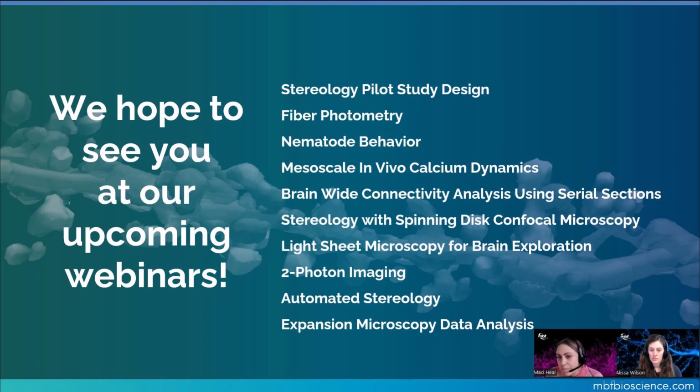And you can input a micron distance of the diameter or the width of those vessels that you are looking at, and that will help guide the algorithm to target those larger vessels. I also find voxel scooping, that's one of the vessel tracing algorithms available to use, again, in both the user guided and the automatic mode. And the voxel scooping algorithm tends to work pretty well for those larger caliber vessels.